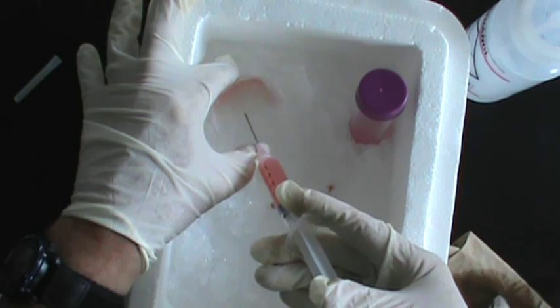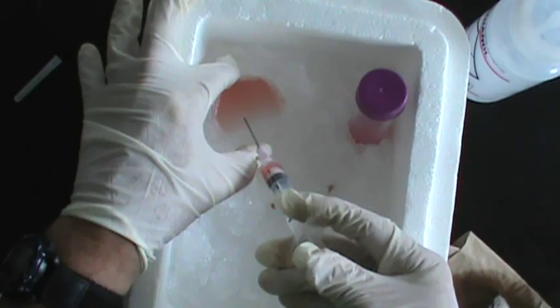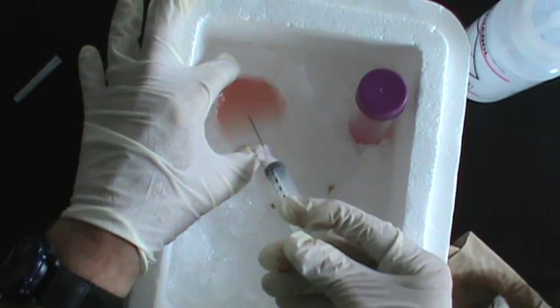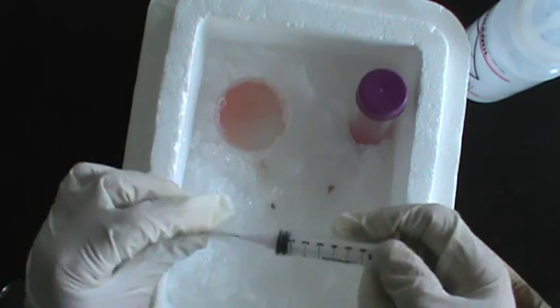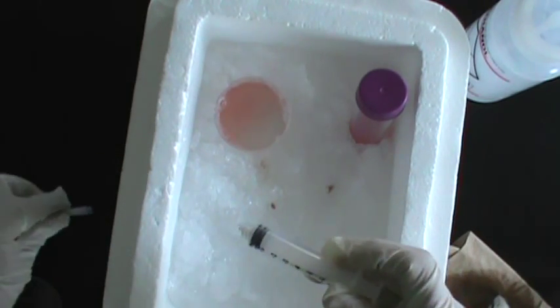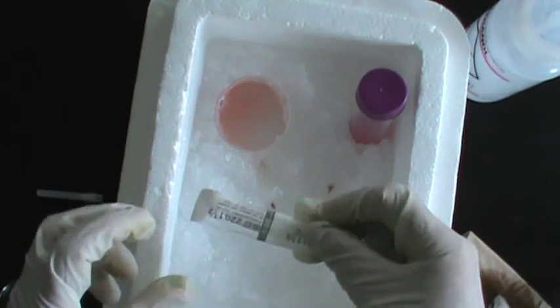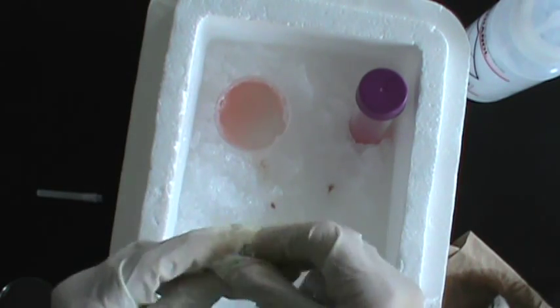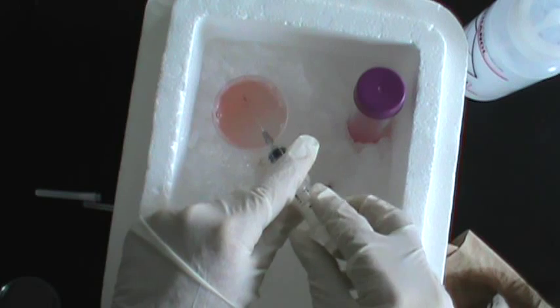Throughout this entire procedure, we want to work as quickly as possible because the spleen cells have just been removed from their normal environment and they will sustain damage throughout this treatment. Then, after we use the 18 gauge needle, we then want to go to a slightly smaller needle, 22 gauge needle, and repeat the same process.